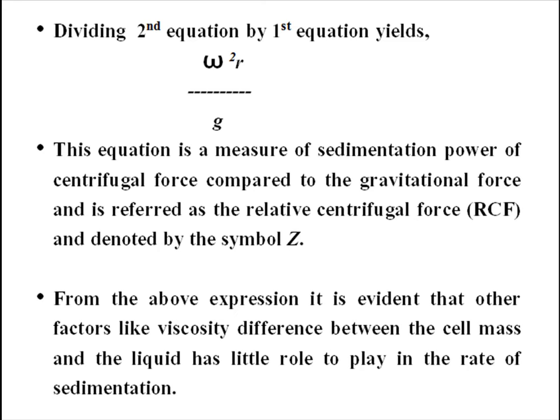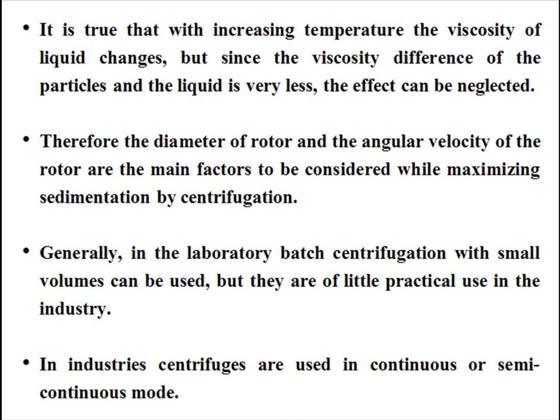Dividing the second equation by the first, we get ω² r / g. This equation is a measure of the sedimentation power of centrifugal force compared to the gravitational force and is referred to as the relative centrifugal force, denoted by the symbol Z. From the above expression, it is evident that other factors like the viscosity difference between the cell mass and the liquid have little role to play in the rate of sedimentation. It is true that with increasing temperature, the viscosity of the liquid changes. But since the viscosity difference of the particles and the liquid is very small, the effect can be neglected.